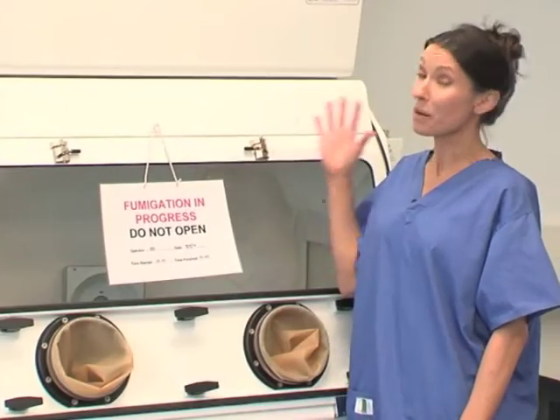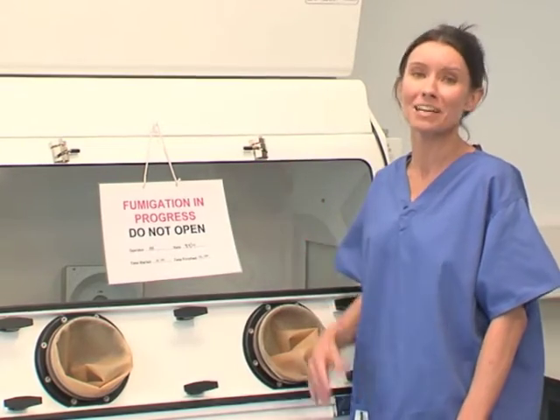Although similar to Level 1, Biosafety Level 2 involves working with microbes of moderate potential risk to laboratory personnel and the environment. Biosafety Level 3 involves working with various bacteria and viruses that can cause severe to fatal disease in animals and humans, but for which vaccines or other treatments may exist. They include virulent Newcastle disease virus and notifiable avian influenza. The Class 3 Biological Safety Cabinet provides the highest level of protection for personnel and the environment.